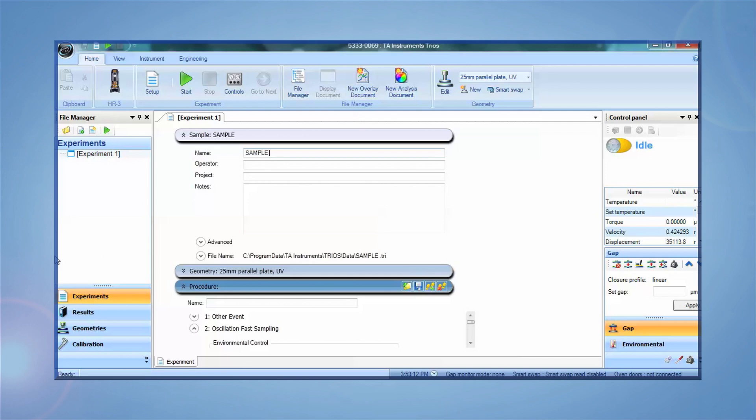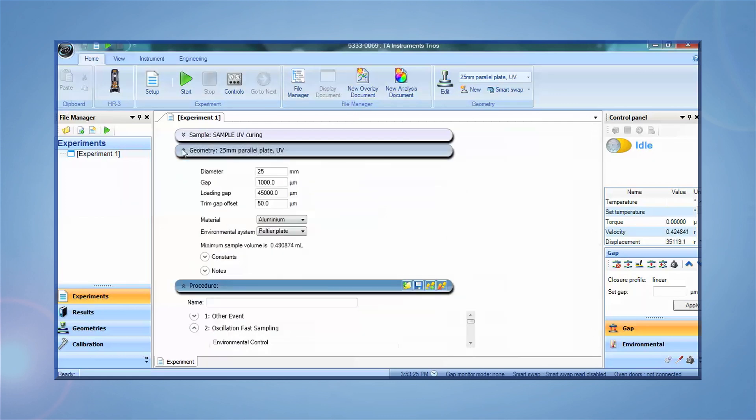Next, it's best to set up the experiment prior to loading the sample. We introduce the sample name, the path, and where the experimental file will be stored. Check that everything is okay in the geometry window and then set up the experiment.